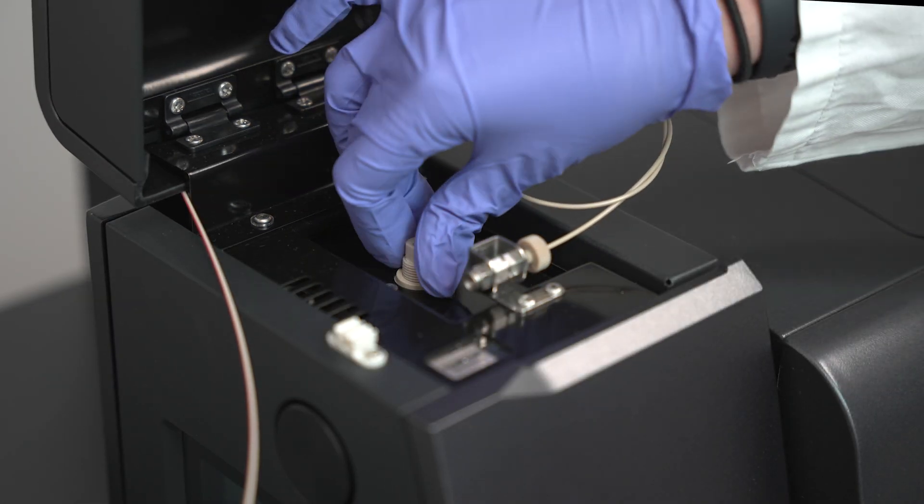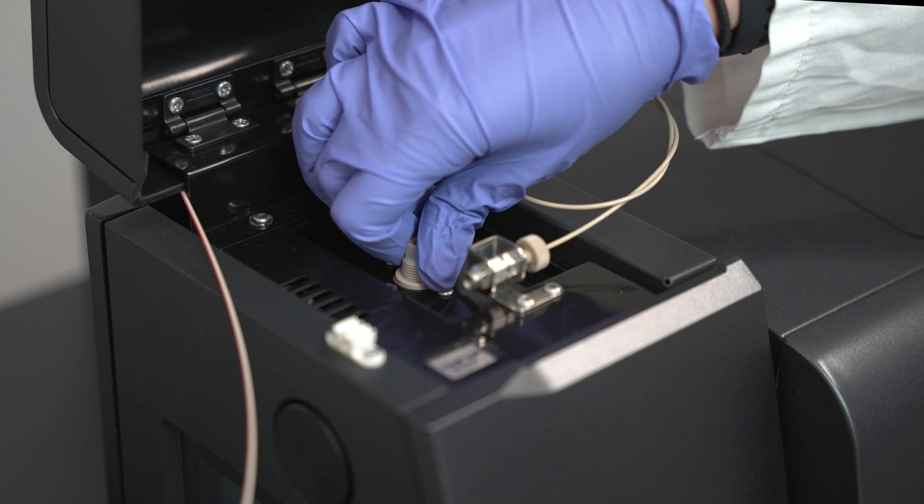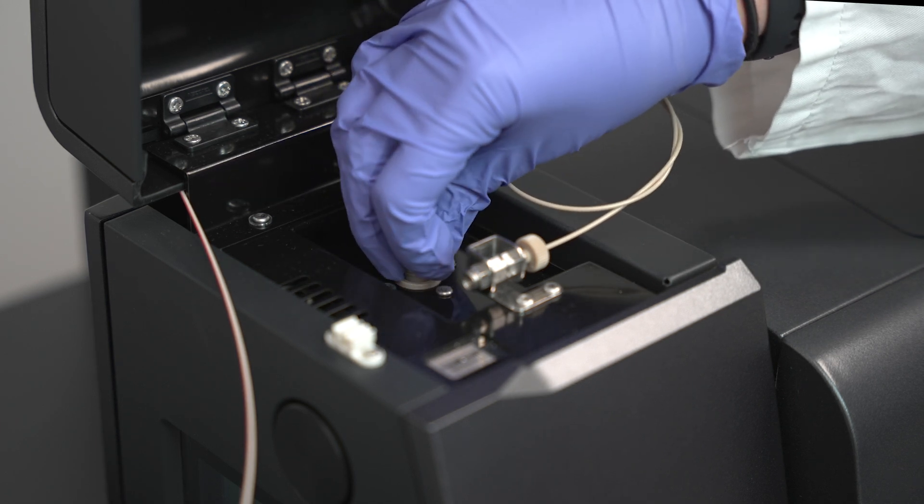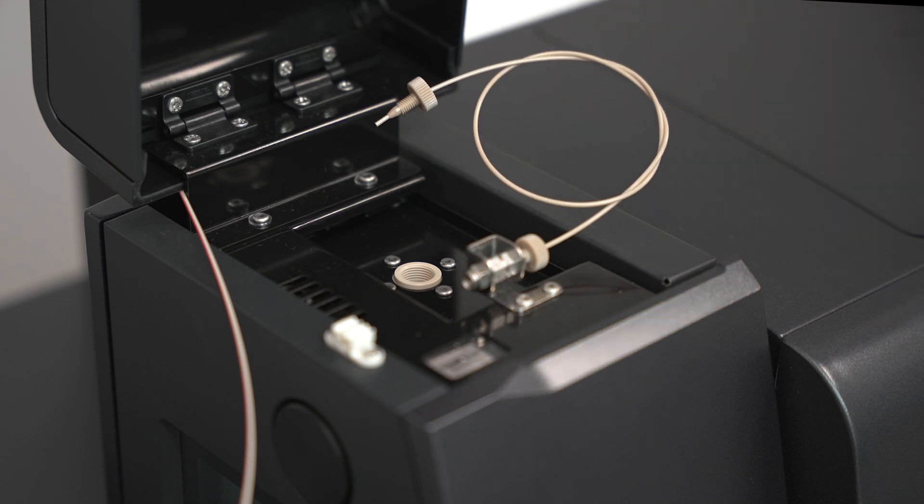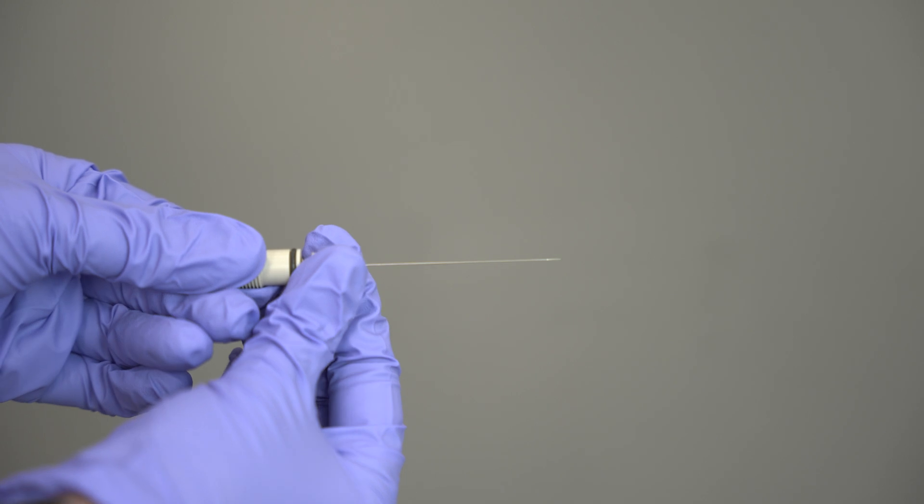Next, remove the ESI coupling and capillary assembly by turning it counterclockwise and lifting it straight up from the source. You can use your fingers for this, or if the coupling is too tight, you can use the 8mm wrench as demonstrated in the instruction manual.